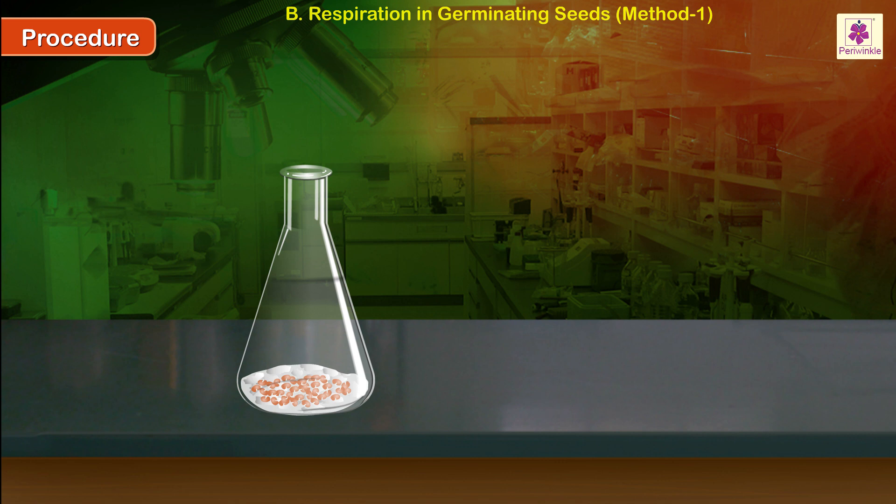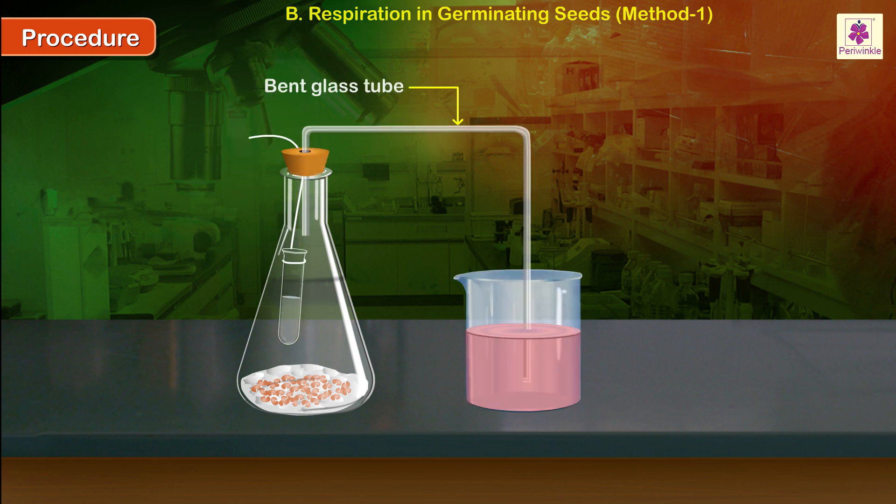Take germinating seeds in a conical flask. Take a narrow test tube and tie one end of a piece of thread at its mouth. Fill about half of the test tube with a concentrated solution of potassium hydroxide. Carefully suspend the test tube in the flask containing germinating seeds. A bent glass tube is passed through a one-hole rubber stopper.